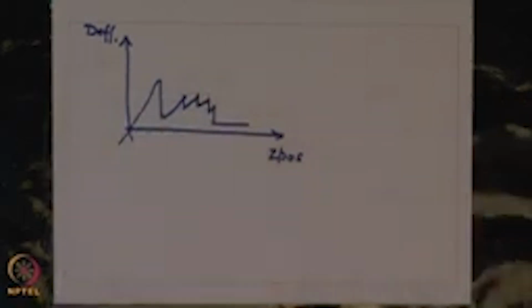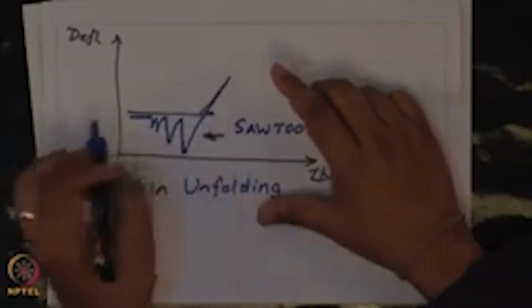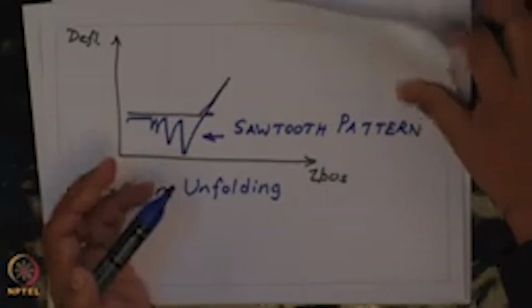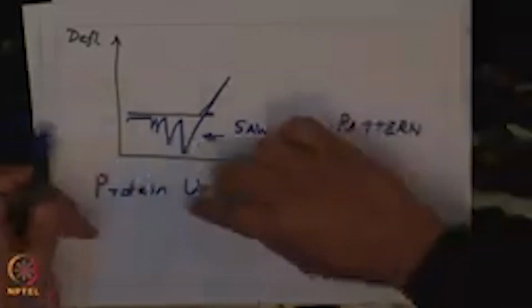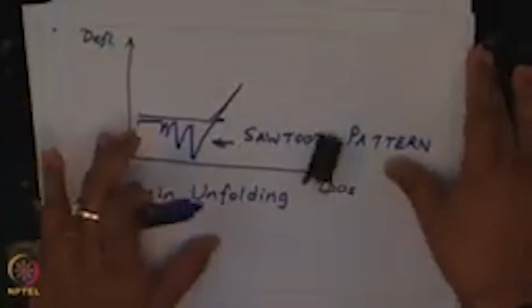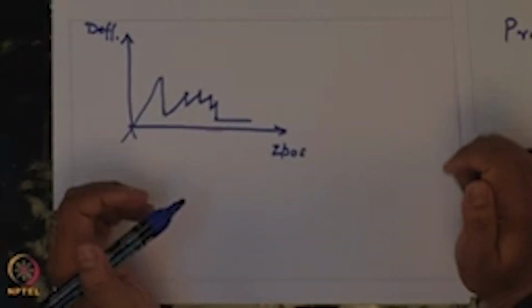Something along these lines. From this curve you cleave this portion and flip it upside down. So, you do two mirror reflections. If you reflect it about this axis, it will come up, and then you reflect it about that axis and translate it, then you will get this. This is the curve that you are interested in for getting insight into protein folding.